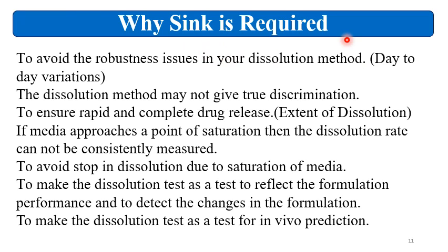Now why is sink required? This is to avoid the robustness issues in your dissolution method, that is day to day variation, variation due to small changes in the volume. Then the dissolution method may not give true discrimination, or the dissolution method will not have that much discrimination power if the sink conditions are not met.